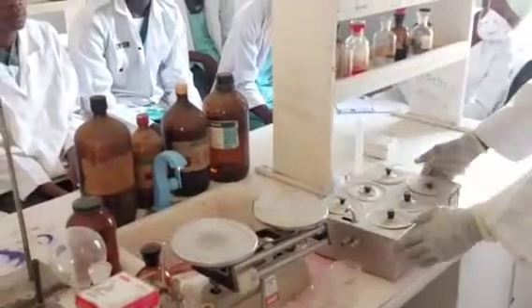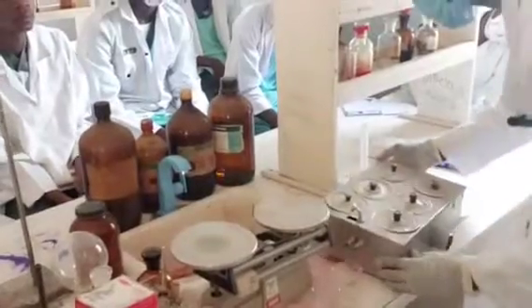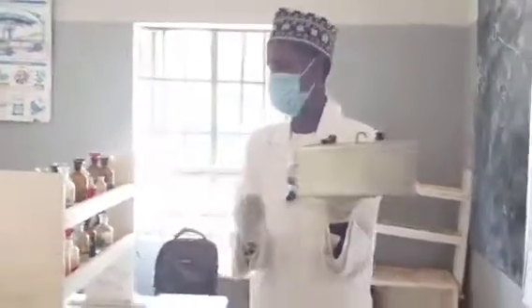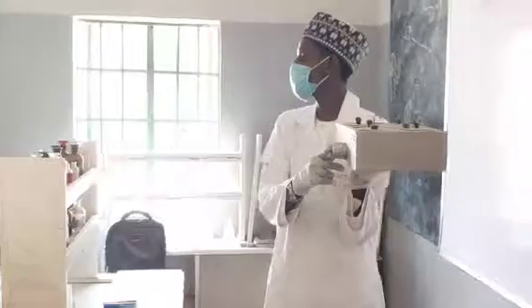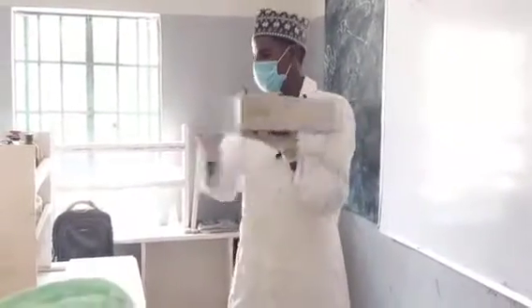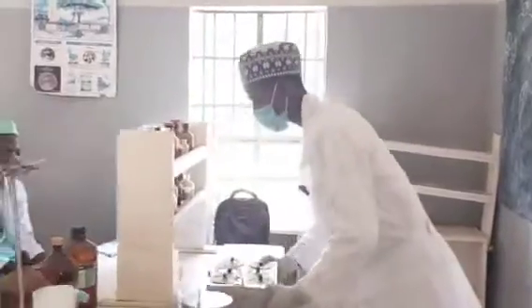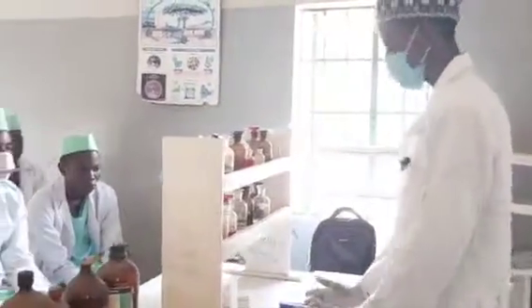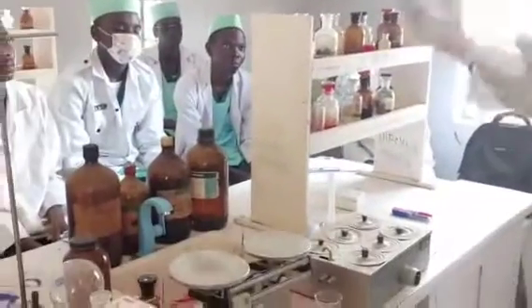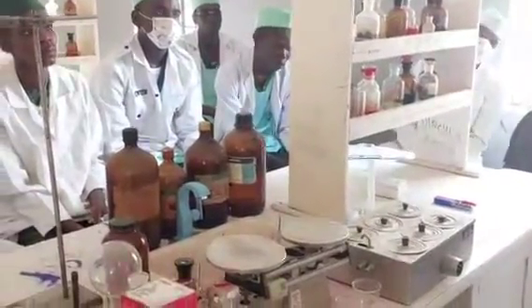And this is the inlet for the electrical connection, the energy source. So if it is connected, then water will be added to it. This is used in the case when you want to heat the reaction.